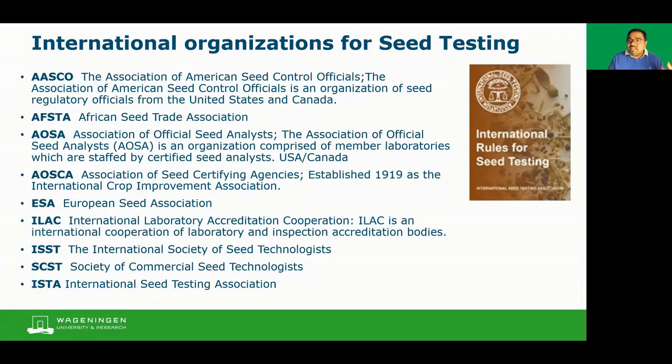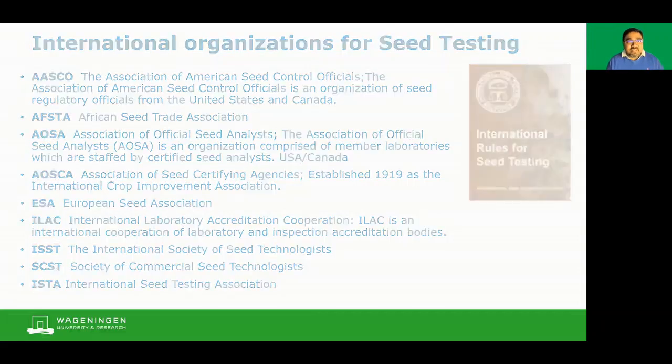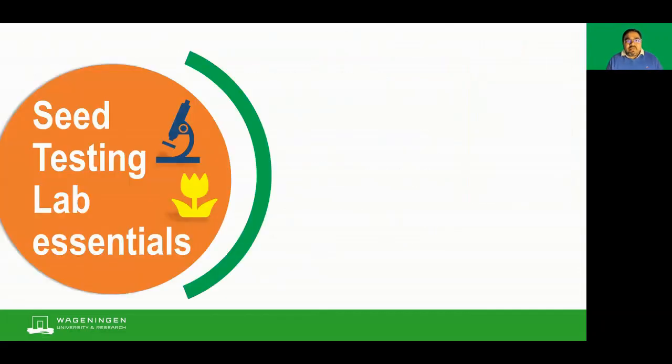So, in a nutshell, these are the international organizations which are involved in seed testing, and those who are implementing different kinds of laws and regulations for seed testing. So now, what we are going to do is learn a little bit about seed testing. And seed testing is done in a seed testing laboratory.